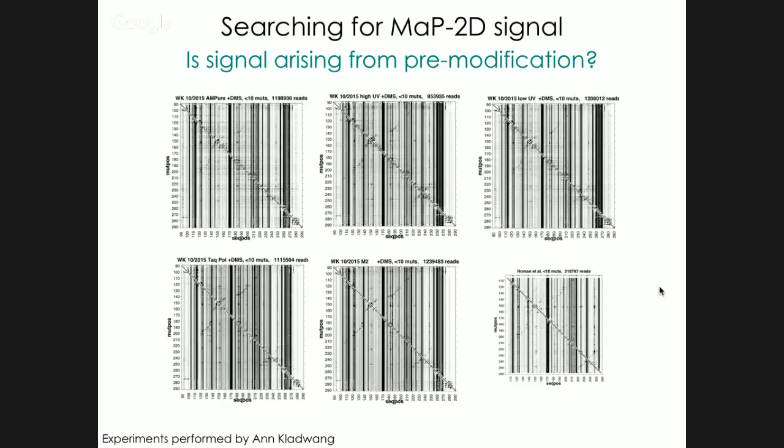You normally use a UV lamp to visualize those bands so that you can locate them and cut them out as part of the purification process. But as Riju and Anne showed in a paper a while back, a high dose of UV actually generates modifications in the RNA at a pretty high rate, even for low exposures to UV light.